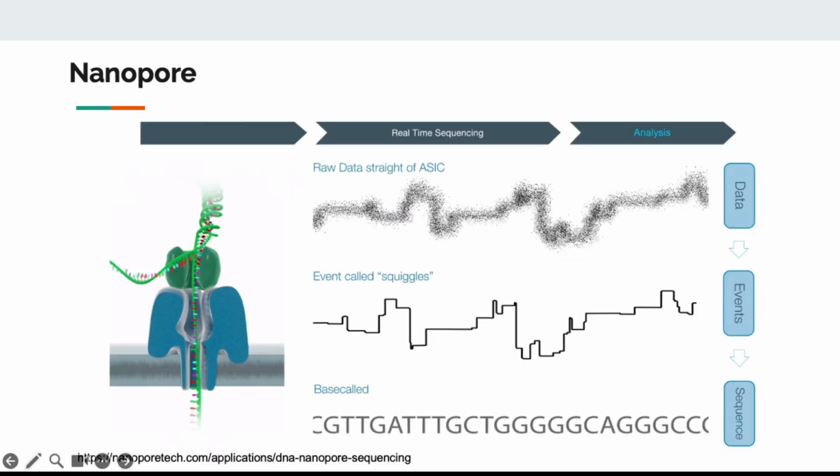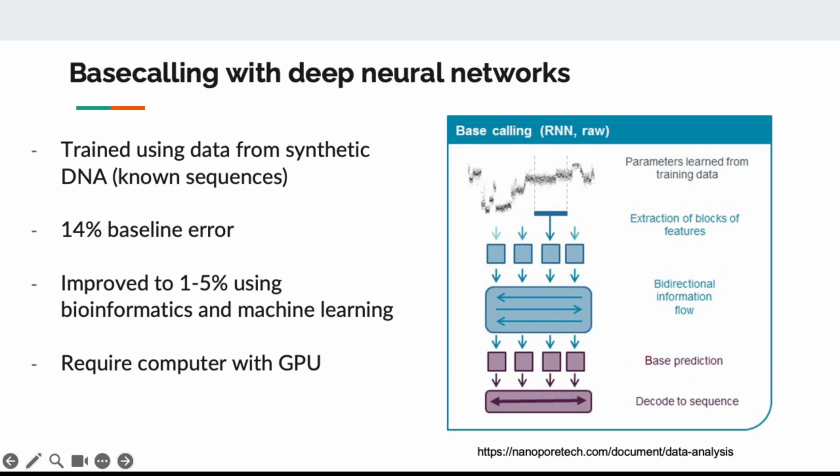So even though we cannot turn signal to nucleotide, because we can synthesize any nucleotide that we want, we can generate signals for those nucleotides. And once we have those patterns, nucleotide and electrical signal, we can train a prediction model that then looks at the signal and tries to figure out which nucleotide it is. So we can decode it by generating a lot of training data.